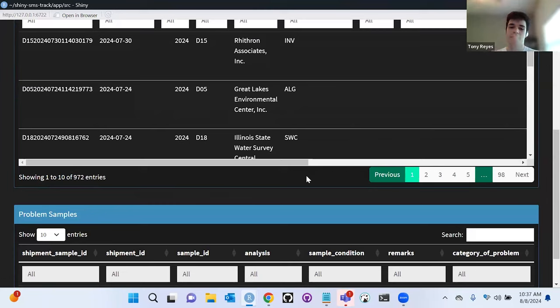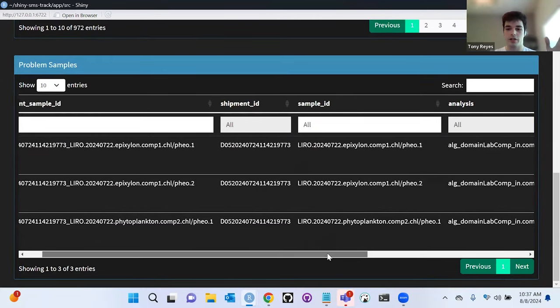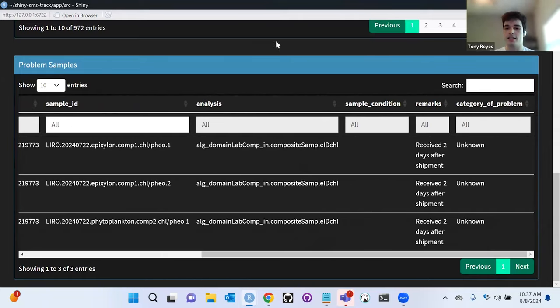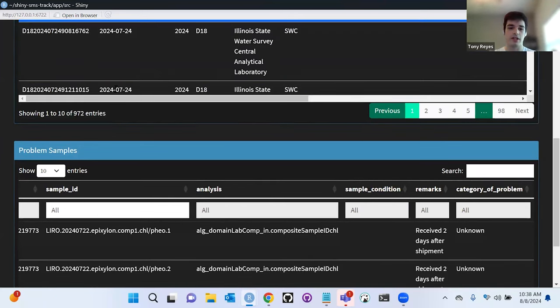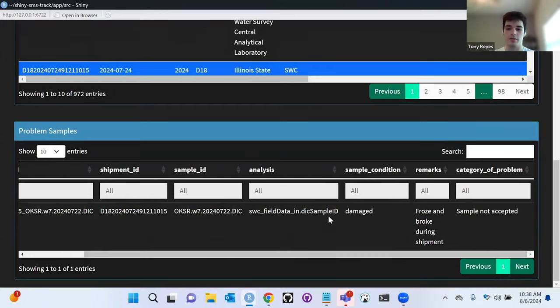Another neat feature: as I said before, there's a problem samples table, which is the sample-level data of each shipment. If I click on a specific shipment and go down, problem samples would contain the samples that have problems for that specific shipment. Here we have extra information: sample ID, the analysis, the remarks, and the category of the problem. If I click on a different one, here there's only one sample, the condition is that it was damaged, the remark was 'broke and froze,' and the category of problem would be 'sample was not accepted.'